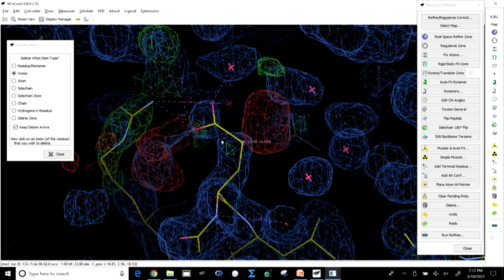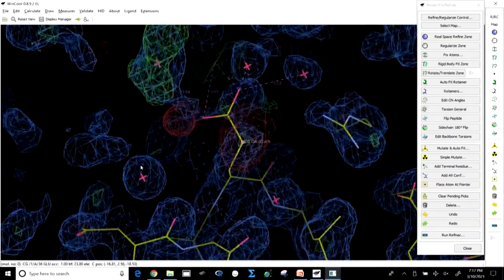But when you are working in a difficult zone of the protein, what I mean by a difficult zone is when the electron density is not good and no program is helping you, you are doing the work with the help of your experience. Then it is advisable that after minor changes you go for a cycle of refinement. The more you perform refinement, the better electron density you start to get.